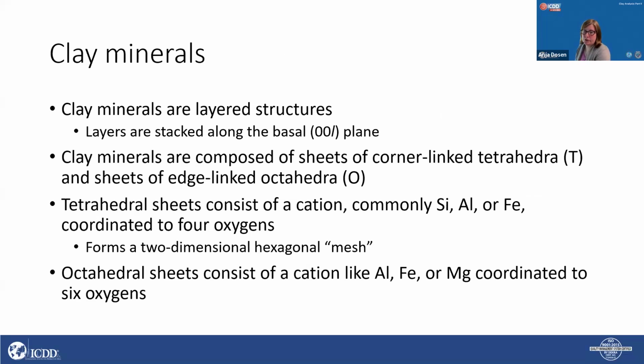Clay minerals are layered structures. This is what makes them so interesting, that they can have expandable structures. Clay layers are stacked along their basal planes. How we can imagine that is like thinking about a deck of cards. You stack your cards, they will lay down flat on the larger surface area. That's exactly what clay minerals are like, and you can stack them in different ways, but they will always stack along the basal plane. They contain layers of tetrahedral sheets and octahedral sheets.